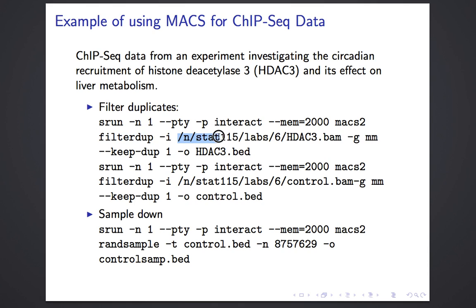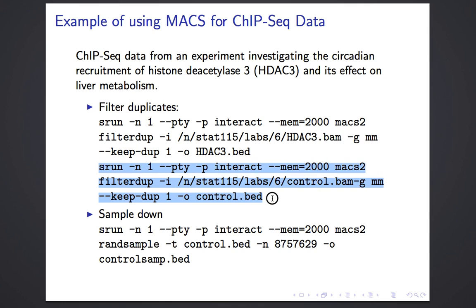The input file is specified with -i, and by -g I specify the genome size. Since my experiment files are from the mouse genome, I specify mm. Then I set how many duplicates to keep in one position — the default is one and most people use one. Then I specify my output file, and I do the same thing for the control file.